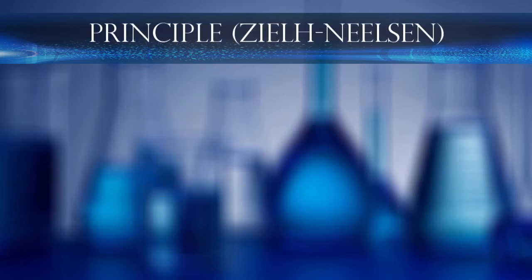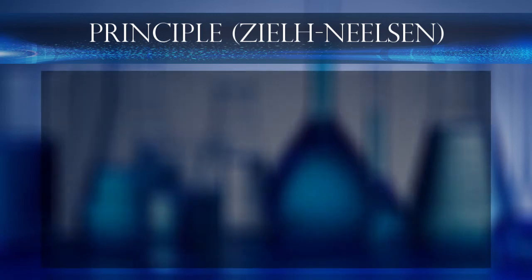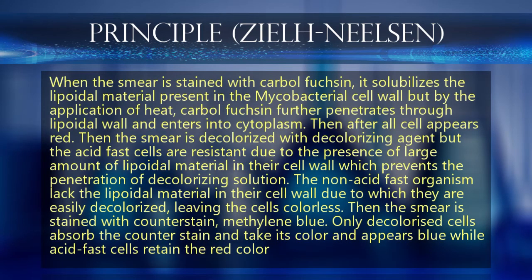The principle of Ziehl-Neelsen stain is, when the smear is stained with carbol fuchsin, it solubilizes the lipoidal material present in the mycobacterial cell wall, but by the application of heat, carbol fuchsin further penetrates through the lipoidal wall and enters into the cytoplasm. Then after, all cells appear red.